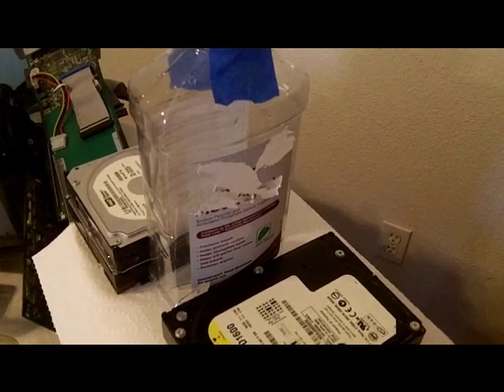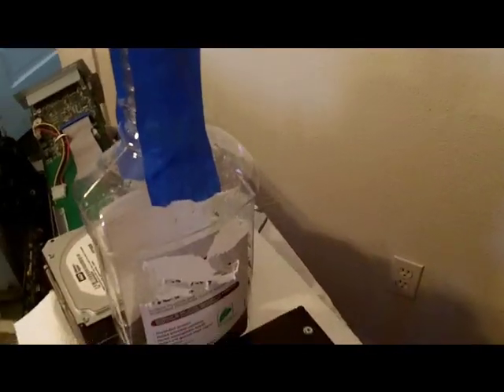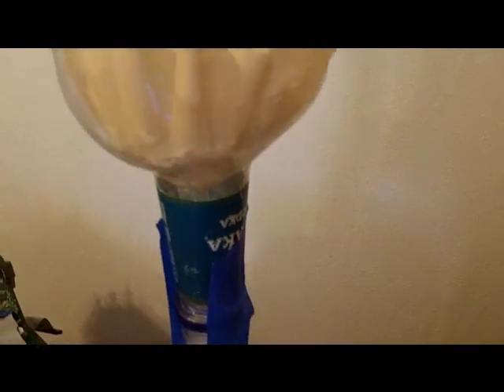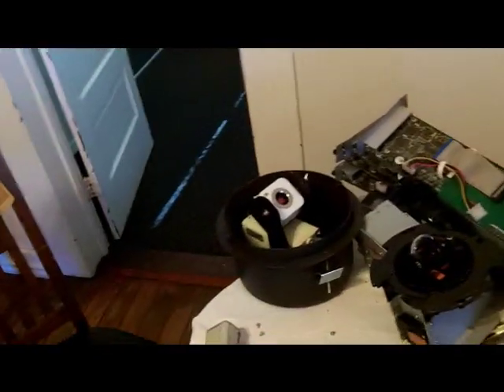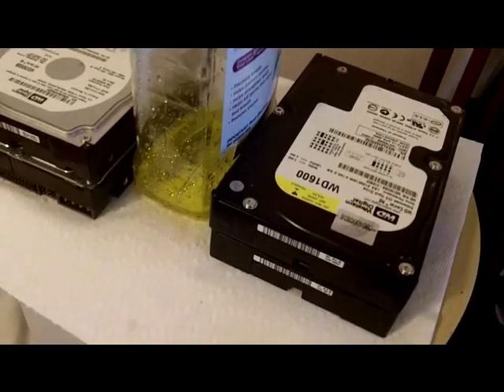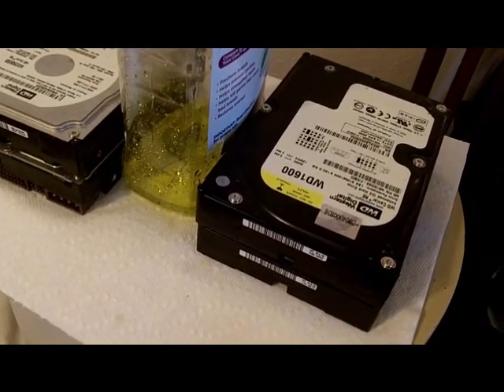It's just a little windy outside. Here's a highly sophisticated filtering system: this consists of a mouthwash bottle — be sure to relabel that, because it may look like mouthwash when we're done, it'll look like gold mouthwash. A little painter's tape, the tip of a vodka bottle plastic, and a coffee filter. Not much to it, not rocket science folks. Just gonna pour it in the top.